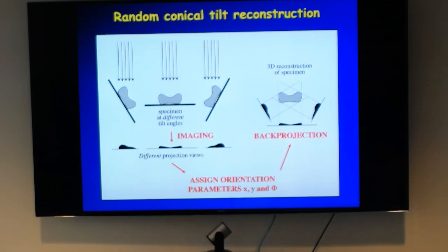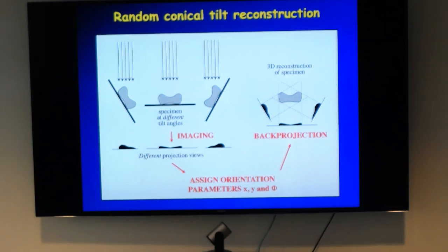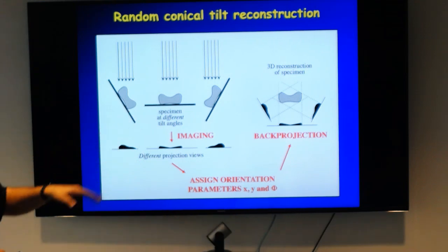It has some problems like the missing cone. If you do negative staining, you have all the negative staining artifacts. But at least geometrically, this is an absolutely defined problem, very easy to get a 3D reconstruction that you can trust. But it's painful because you have to tilt, you have to pick two particles, one from tilted, one from untilted, so people didn't like to do that. And also in ice, in vitrified ice, you usually don't have the preferred orientation, so this approach doesn't work anymore.